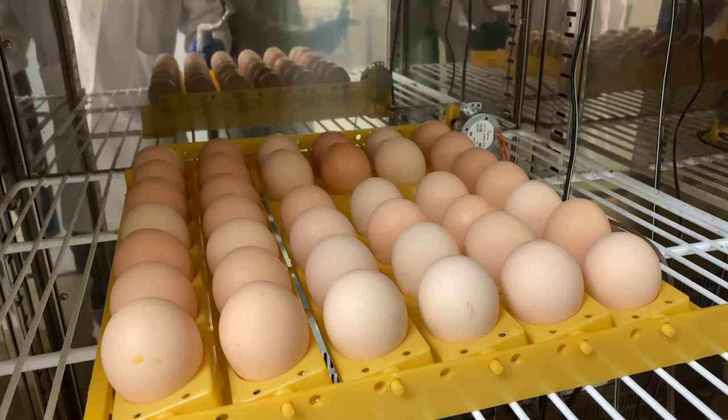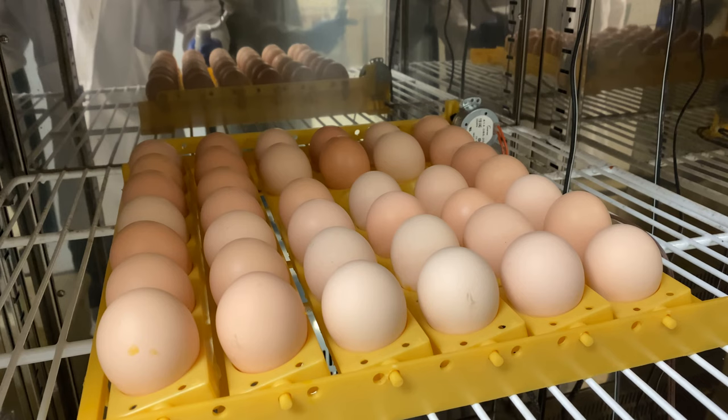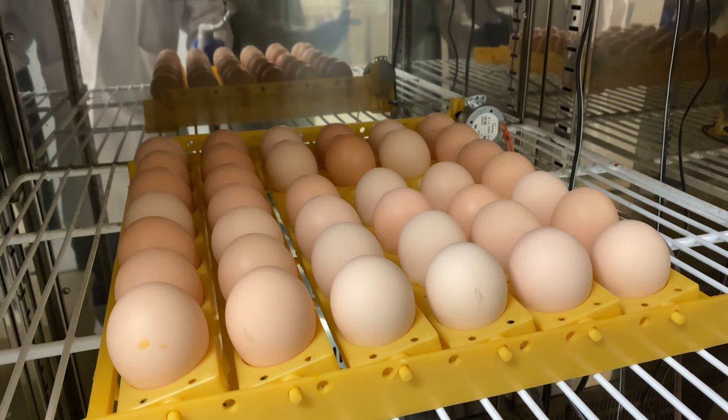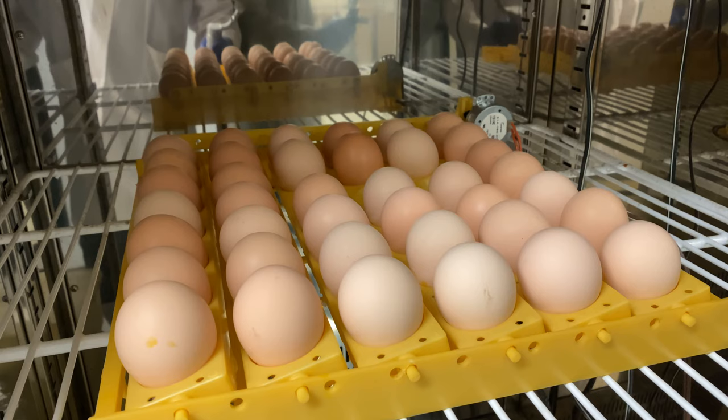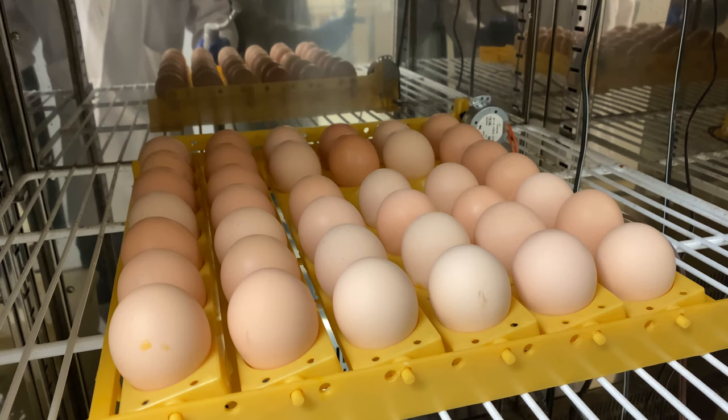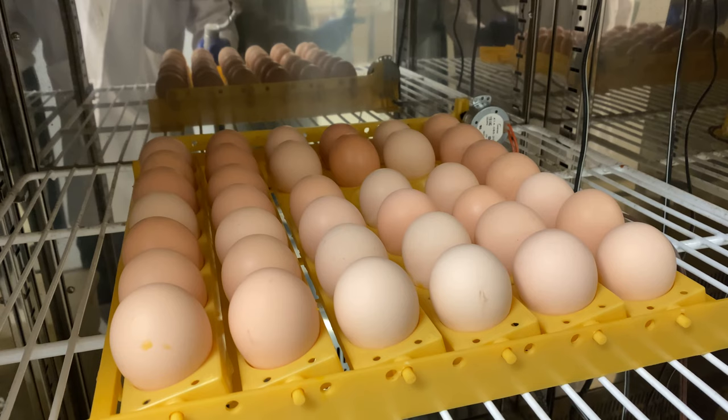We will crack the egg open, invert it to dump the embryo out, and clean it with PBS — phosphate buffered saline. We will then terminate the embryo by cutting through its neck to decapitate it. This is done humanely and as quickly as possible. The knowledge our students gain outweighs the ethical issues involved. Please note that these chickens were taken from a chicken farm and were going to be terminated eventually for food.